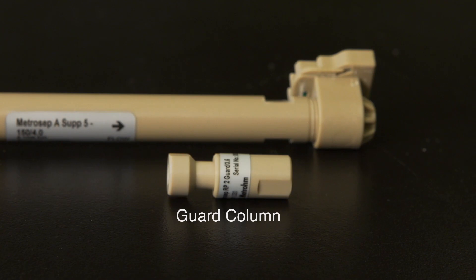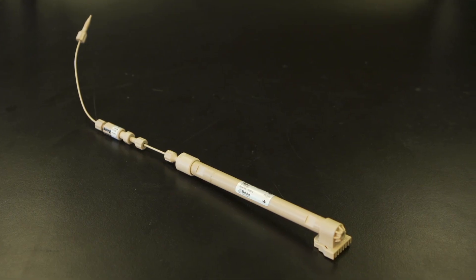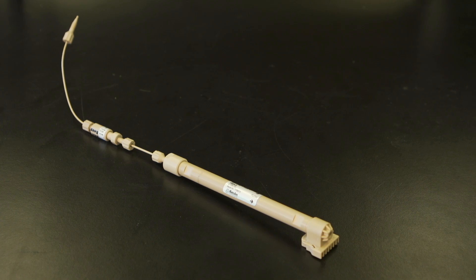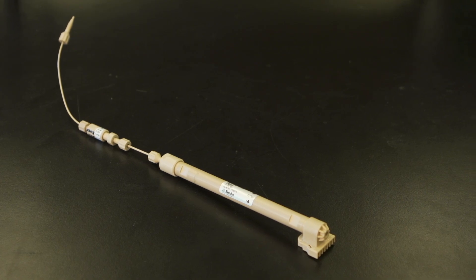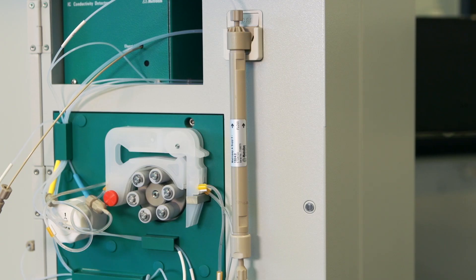Often, a guard column is placed before the analytical column. The guard is a short section of column similar in composition to the analytical column. It filters out particulates and strongly binding contaminants that may never release from the column material. This allows the much more expensive analytical column to have a longer life.